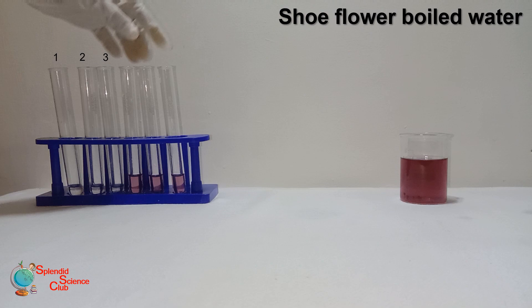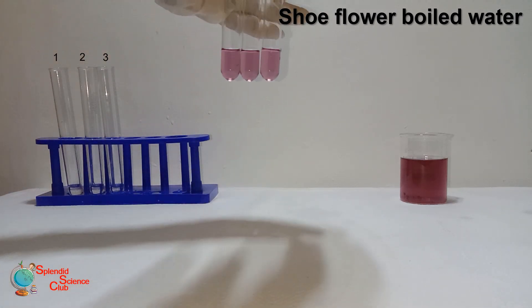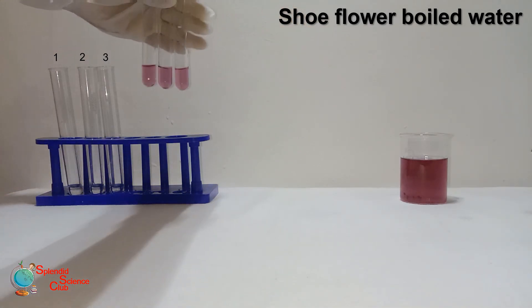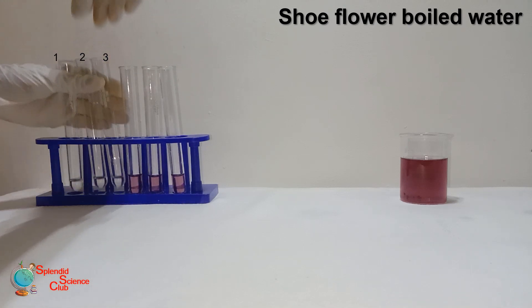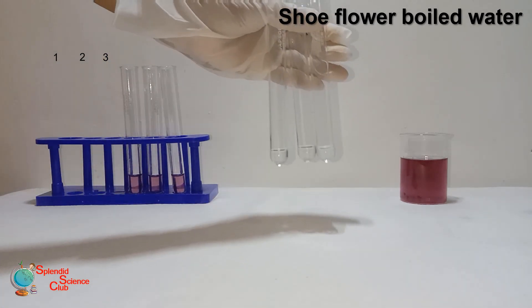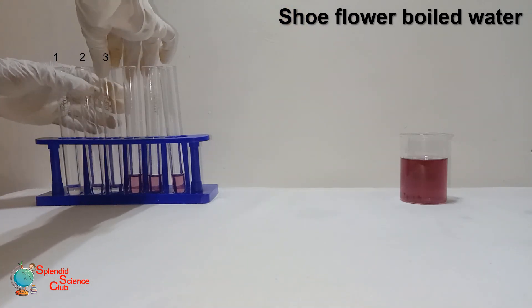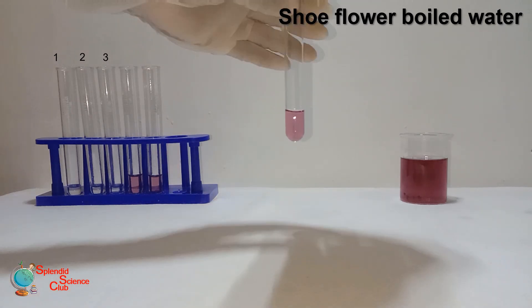We can do the same with shoe flower boiled water — it's also a natural indicator. As in the previous experiment, we have taken equal amounts of the prepared solution. Test tube one contains hydrochloric acid, two contains the base sodium hydroxide, and three is water, which is a neutral substance.